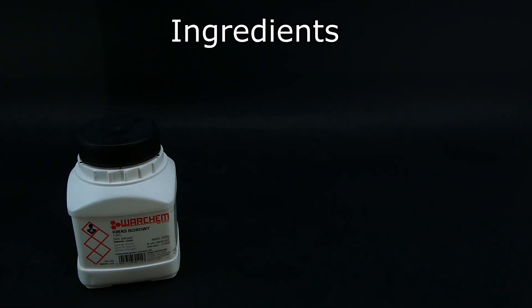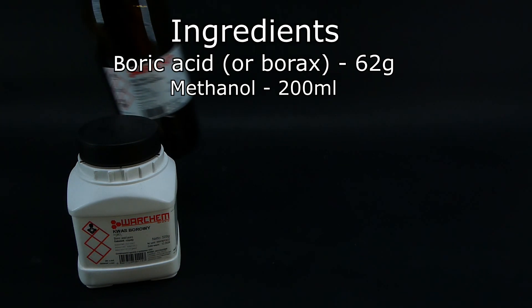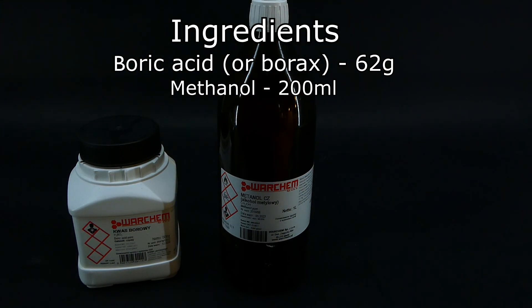Firstly, I am going to of course need a source of boron, and this can be boric acid or borax. Both of them work well for this reaction, and I used boric acid because I had it on hand. The second ingredient is some methanol. I have to use a pretty big amount because some of it will evaporate, and a large portion will not get converted into the trimethyl borate.